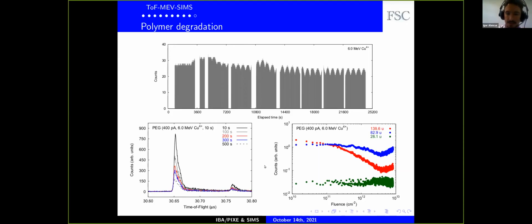And this is indeed very nice because we can record one spectrum in 10 seconds or even 1 second. And this was the program that we wrote with an Arduino to record the different experiments. So in this case, for instance, there will be 600 expected. So these are the different experiments performed. This is how we calculate the flux and then convert to fluence. But this is the overview that I can give you here in the 15 minutes that I have.